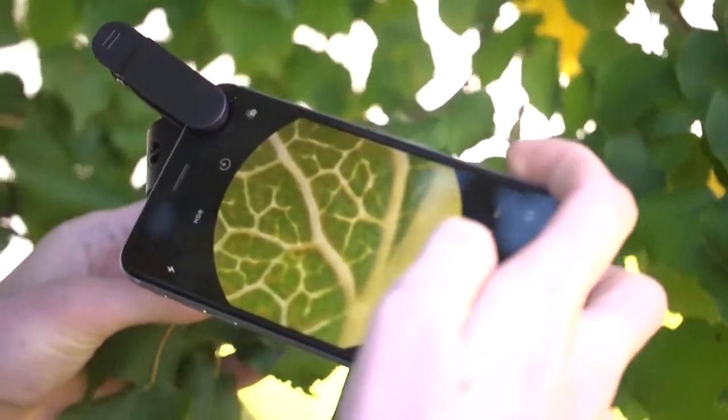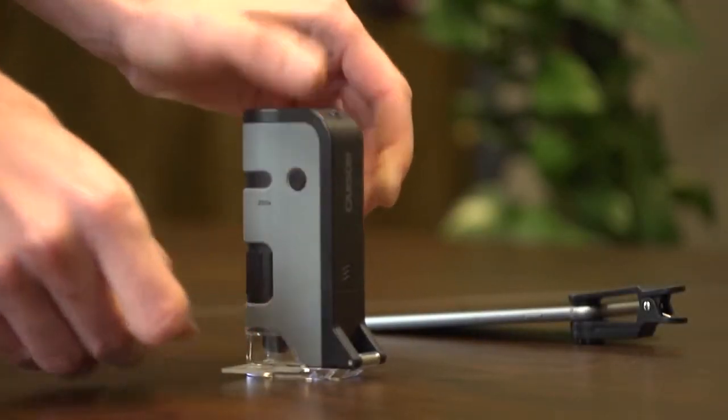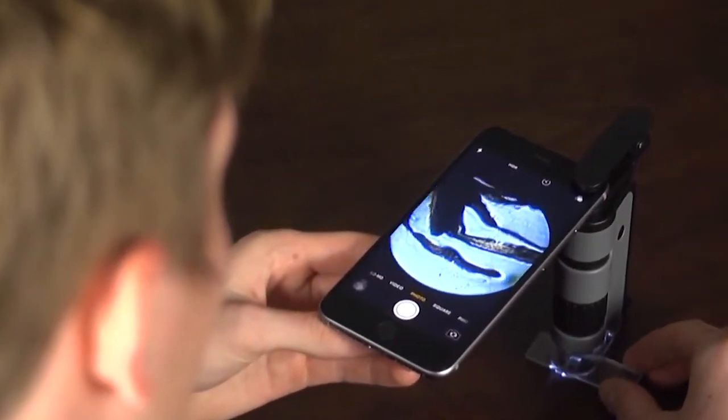I also like how versatile the MicroFlip is. With the LED light turned on, you'll be able to get crystal clear results in any lighting condition. When you flip out the base plate, the LED lights will automatically change to a setting that's ideal for viewing different slides.